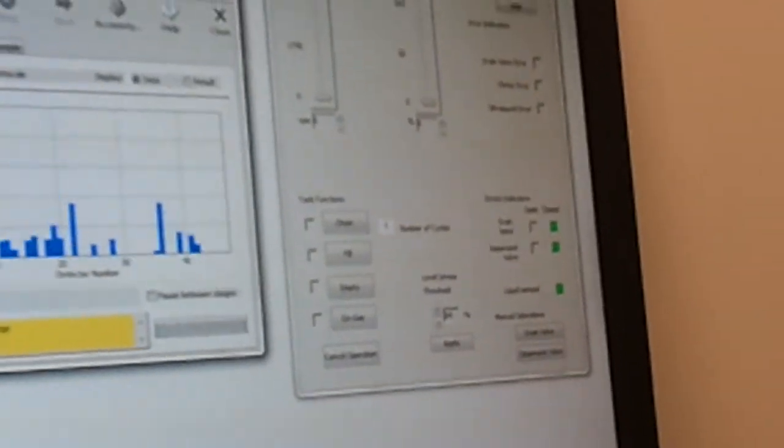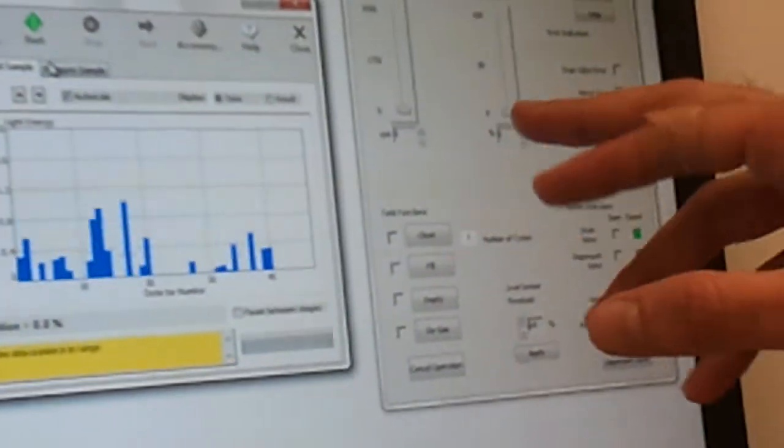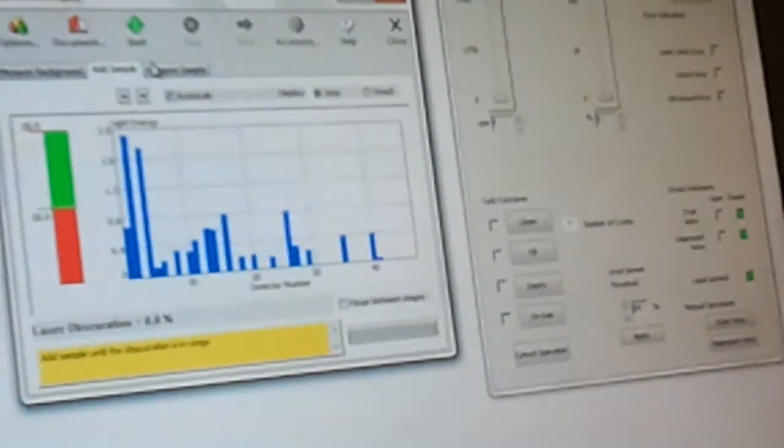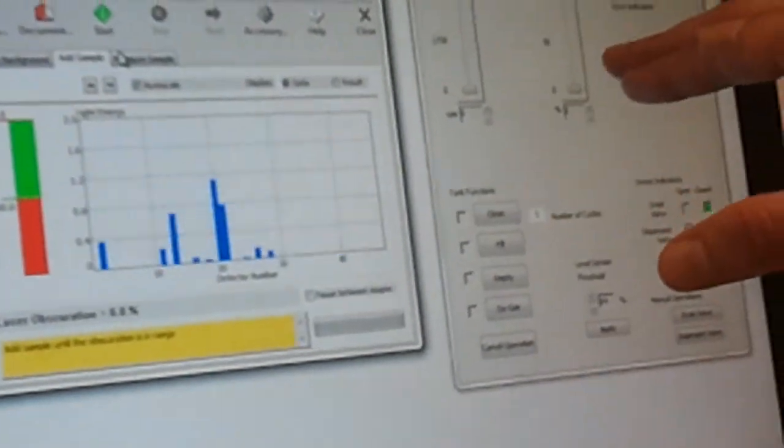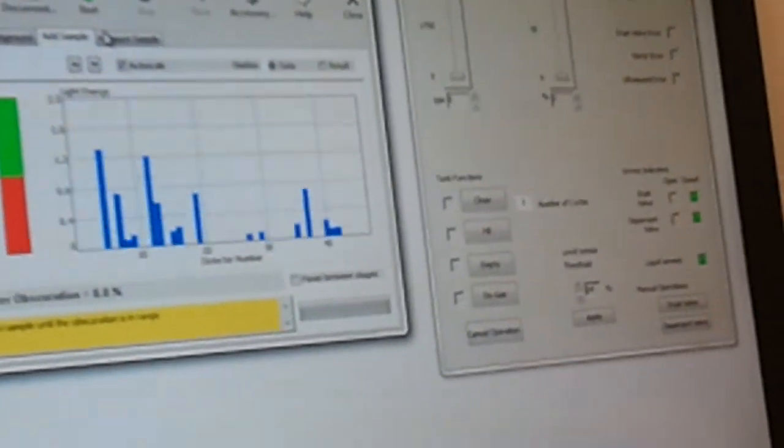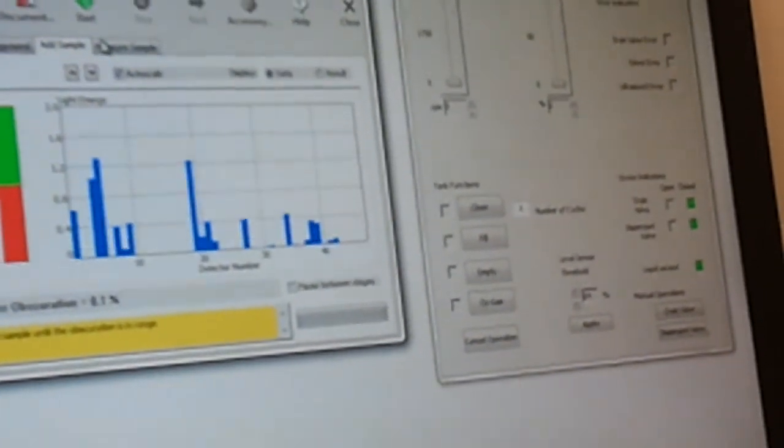That way you prevent that after you get to a comfortable level here and you turn this on, it won't just fluctuate out of other boundaries again.